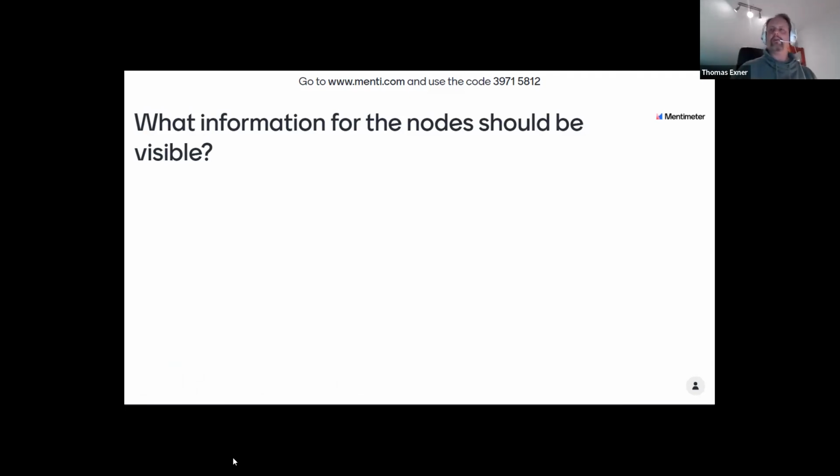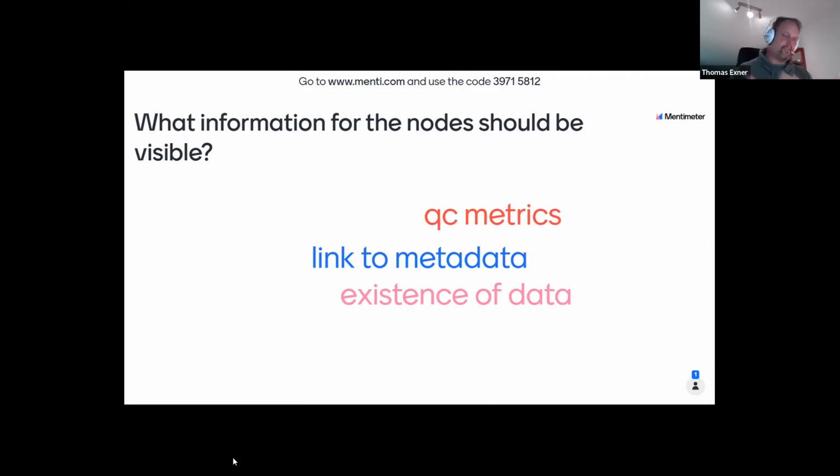If not, that's fine as well, or if you have to think about it, that's fine, but just having the idea of what you think might be needed, to be quicker than having to go to the data file which is behind that.